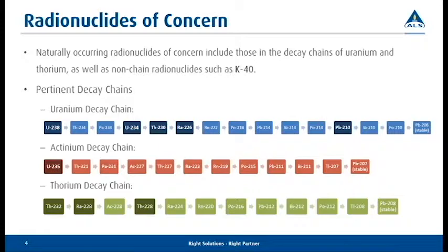Jay asks, will you please provide a quick overview of reading data? Yes, ma'am. Most data for radionuclides are given to you on an activity basis with what we call the uncertainty, the TPU, total propagated uncertainty, and then an MDC. So you're usually going to see your result looking like, as an example, 3 plus or minus 2, MDC of 1.